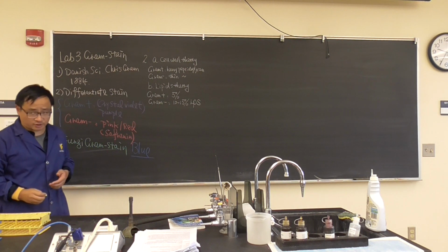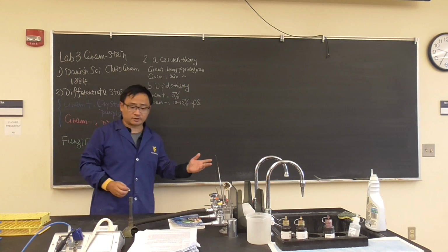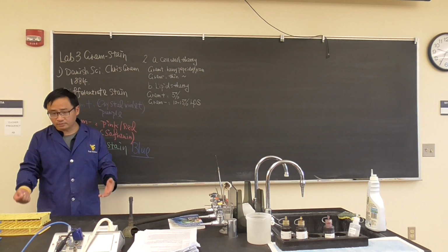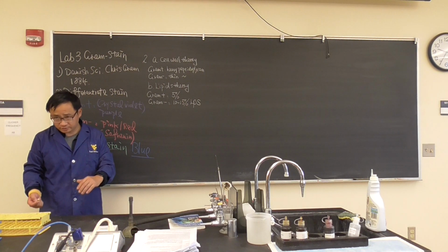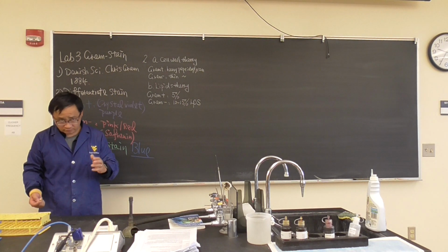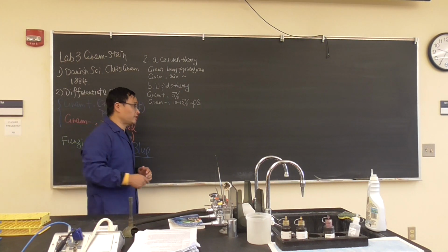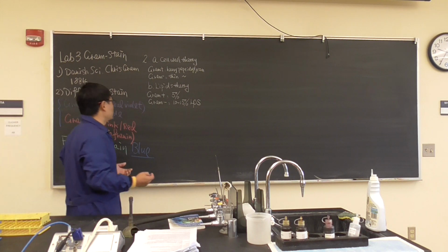The major component of that is lipid A. Because gram negative bacteria have a huge amount of lipids, during the decolorization they, together with the dye crystal violet, are dissolved in the alcohol. So it becomes blank, and when you counterstain with safranin, it shows up. Okay? Very briefly talk about that.